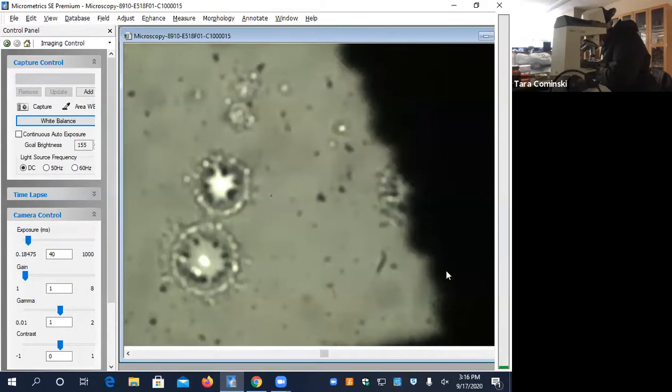Now we're on number 5. And by the way, we're going to skip number 5. We're not going to make cheek cells because I realize maybe because of COVID we shouldn't be swiping toothpicks in our mouth and then putting it on a slide. So we're just going to do number 6, onion.